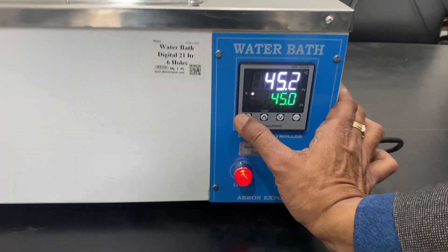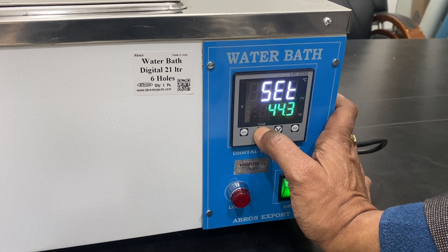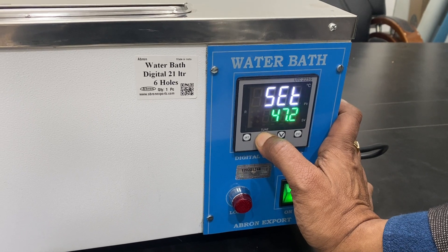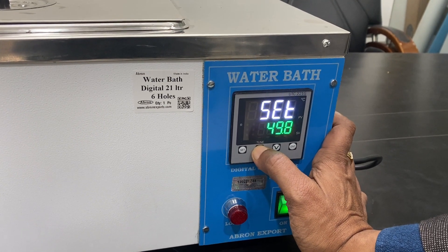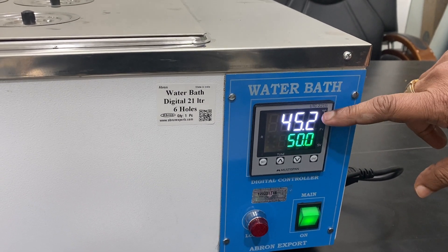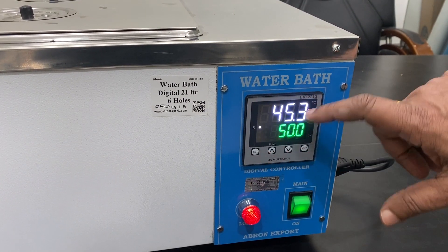Let me show you how to set the temperature. Press the set button — it says 'set temperature.' You can increase it using the up arrow; it goes faster when held. I can set it to say 50 degrees and then press enter. This display shows the set temperature, and this one shows the inside temperature. When the temperature gets close to the set value, the heating will slowly become slow.